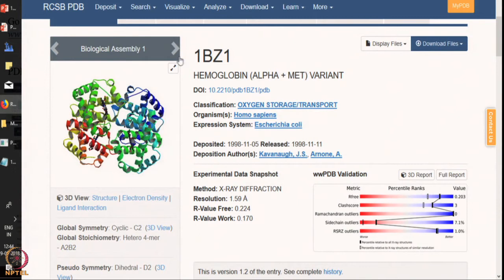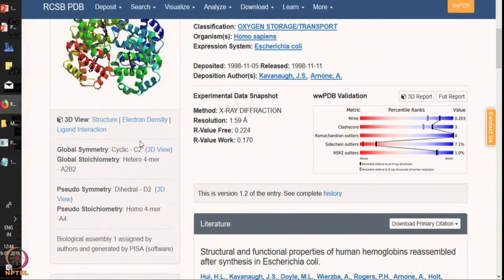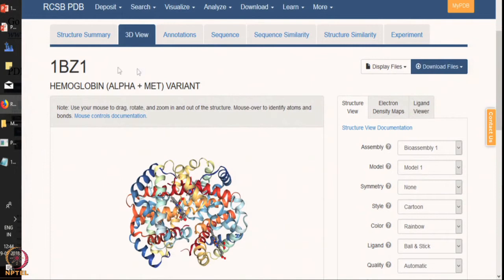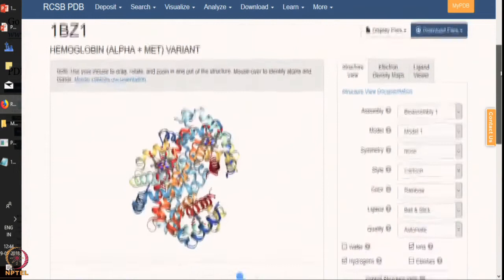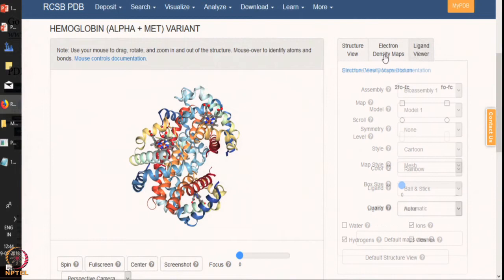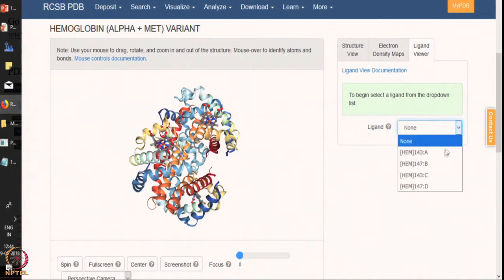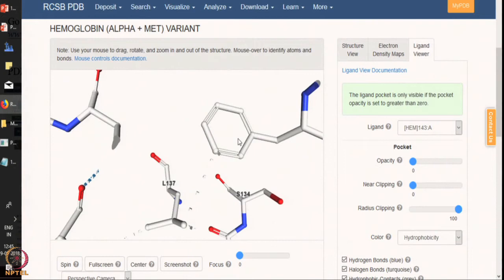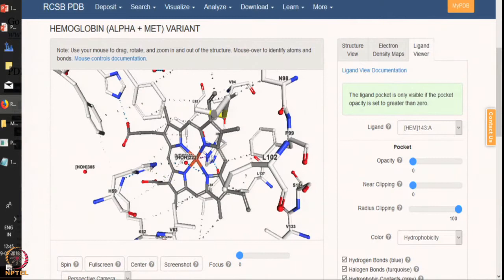Now if we click on 1BZ1, we will get all the information available on this molecule. You can see various information and we can see the 3D structure as well. PDB has an inbuilt interface which helps you in visualizing the structure of the molecule. You can also see there are 3 tabs: structural view, electron density map, and ligand view. You can see there are a lot of ligands bound to the hemoglobin molecule. You can click on it and it will give you a ligand view of the molecule. Here you can zoom in and see the residues, including the heme residues bound to the hemoglobin alpha subunit.